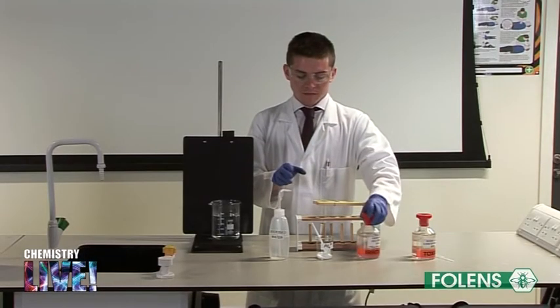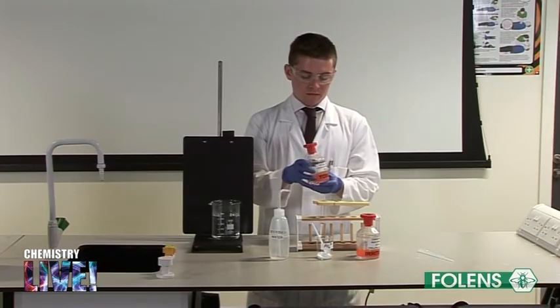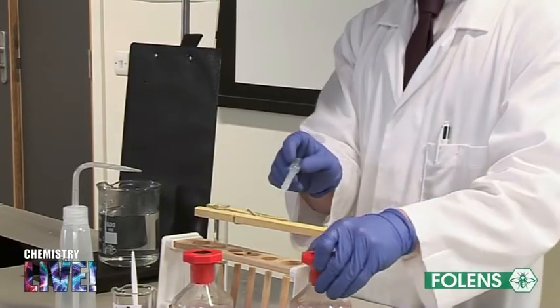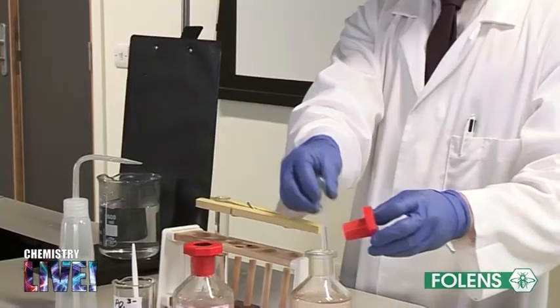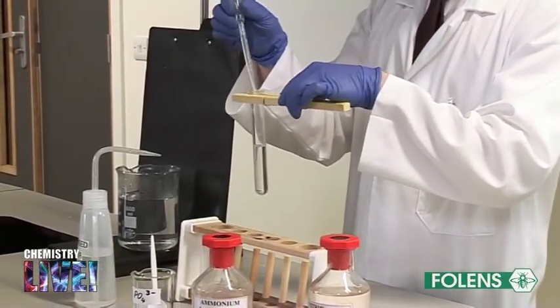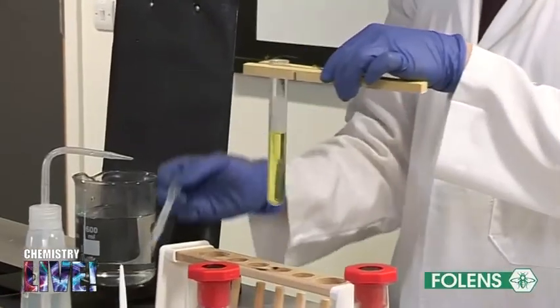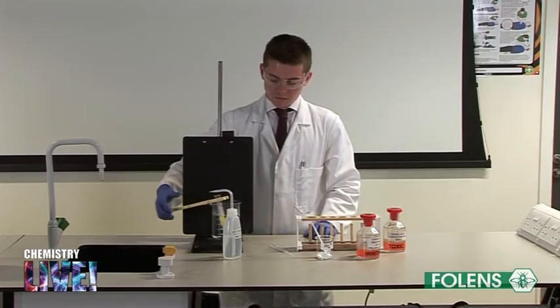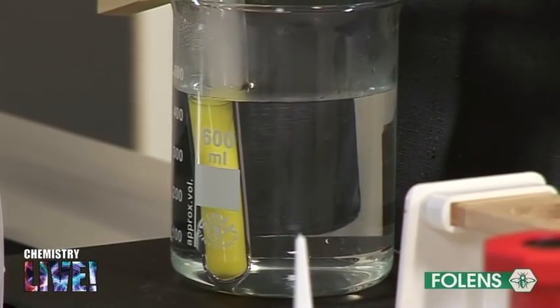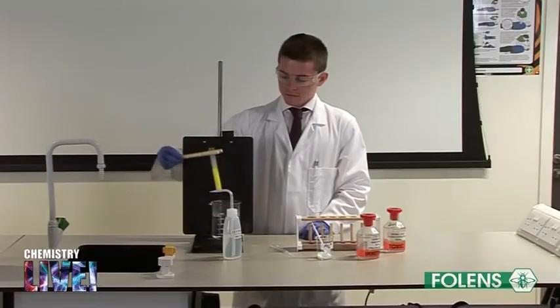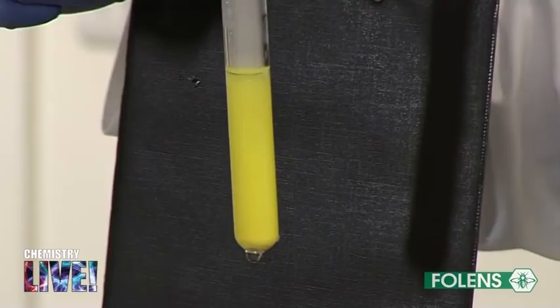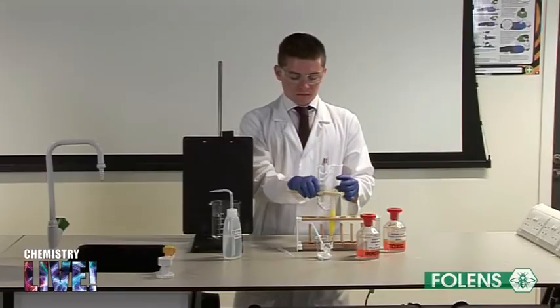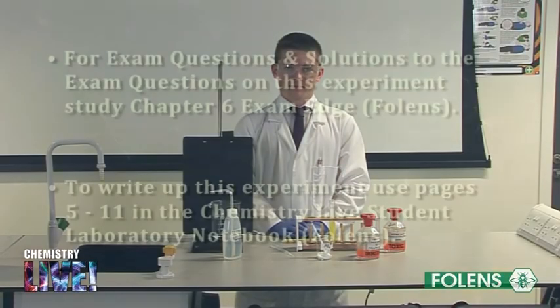This step involves the use of concentrated nitric acid. Extreme care must be taken with this substance. Using a dropper, add 5 drops of concentrated nitric acid to the test tube. Place the test tube in warm water, about 60 degrees Celsius. Note the formation of a yellow precipitate. This yellow precipitate is a substance called ammonium phosphomolybdate. You are not required to know the equation for this reaction. We conclude from this experiment that phosphate ions are present in solution.